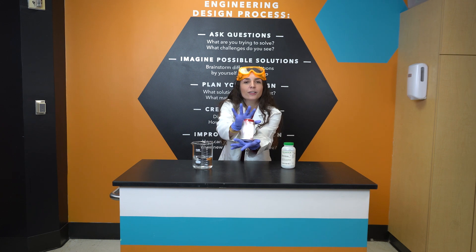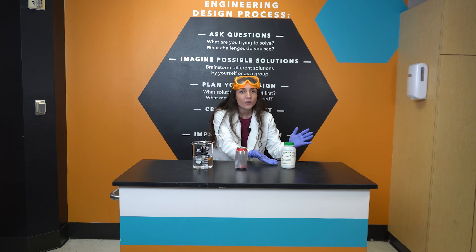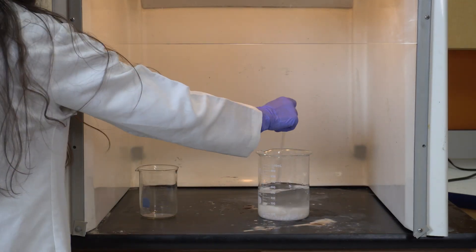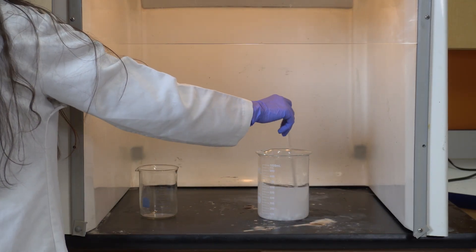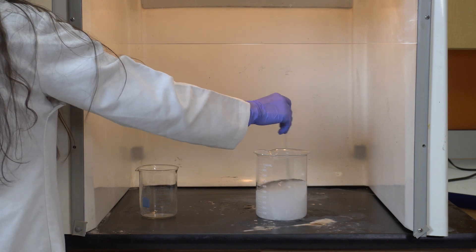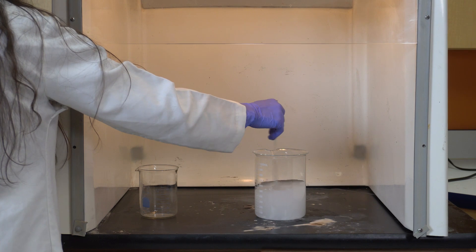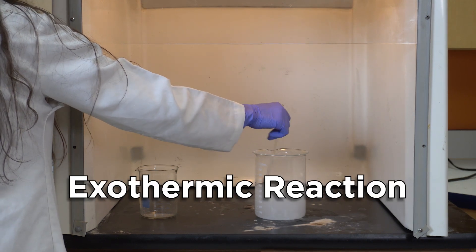This can is made out of aluminum. To make it disappear, we'll need the help of some chemicals. On my experiment table I have sodium hydroxide and water. When we mix this sodium hydroxide with water, it starts to heat up. This heat is energy that comes from the molecules ripping apart and recombining. We call this an exothermic reaction.